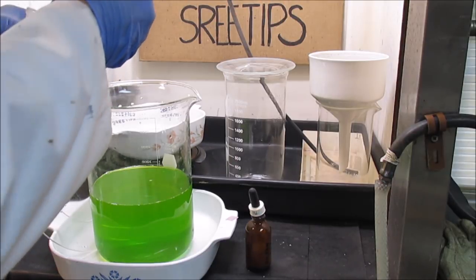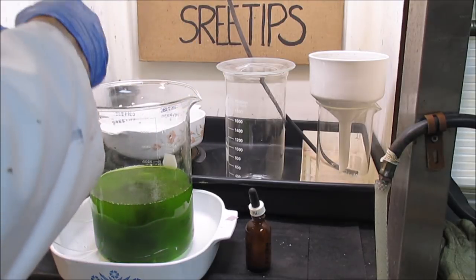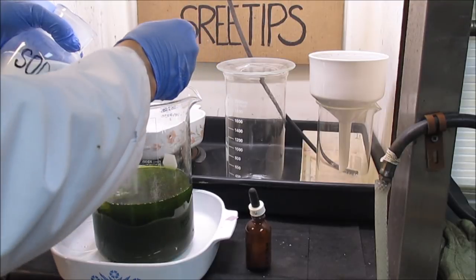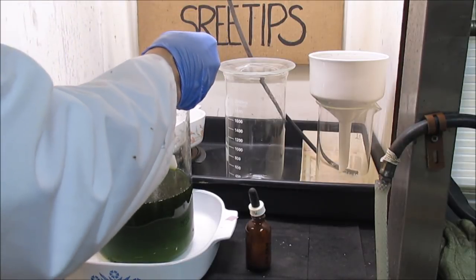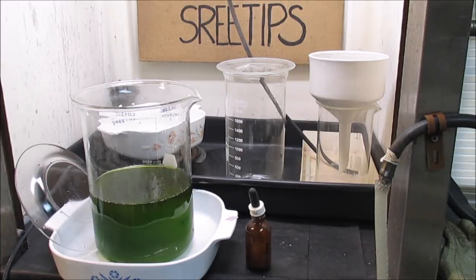Here you can see the gold coming out of solution when I add the sodium metabisulfite. It comes out nice and brown, just like it should. But then if you watch, it all goes right back into solution. The solution goes back from brown back to green. That's probably due to a bunch of excess nitric acid being in that solution. It's redissolving the gold just as fast as it's precipitating the gold out of solution.